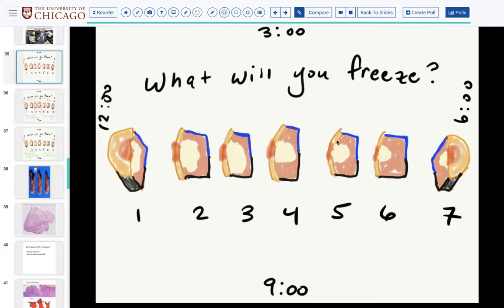Cool. So once you have your specimen, we used to do it a lot at MGH, let me just say, for skin that had a lot of underlying fat, honestly, and those turned out fine. So yeah, that's my 2 cents.